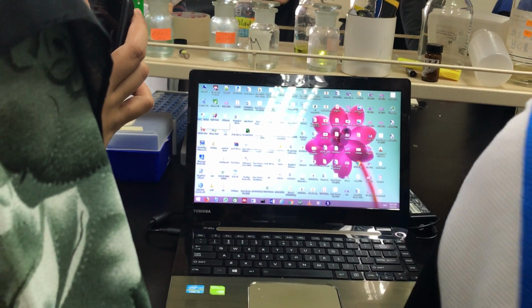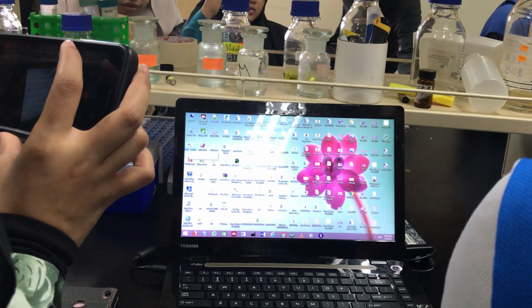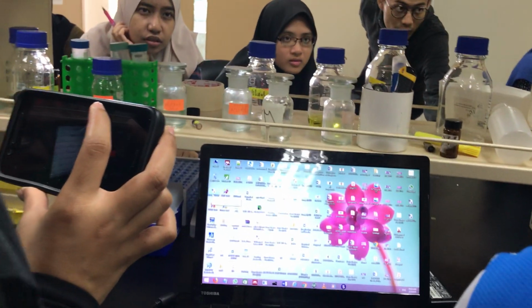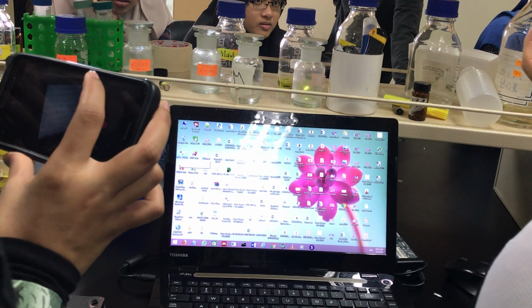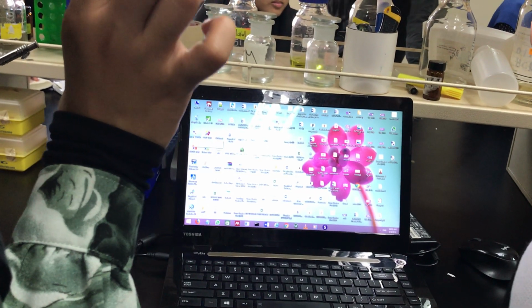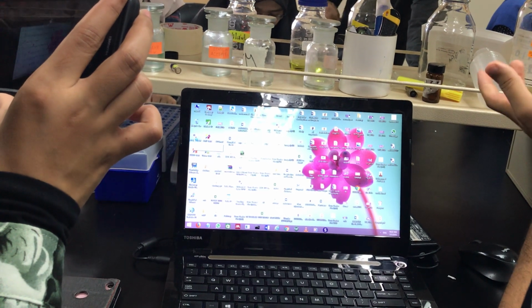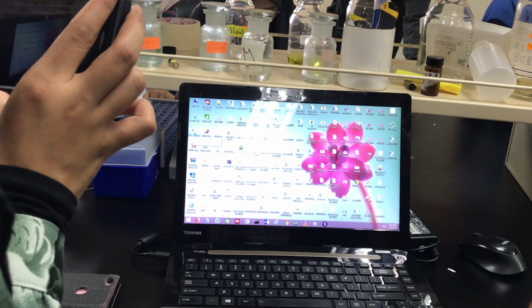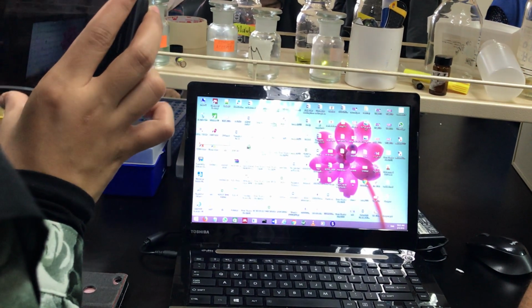Okay, I will sample it for you. The software is not working if we have to see correlation. In our case, we want to correlate between FTIR and antioxidant activity. Why are we doing this work? For quality control only. Most importantly, for quality control.